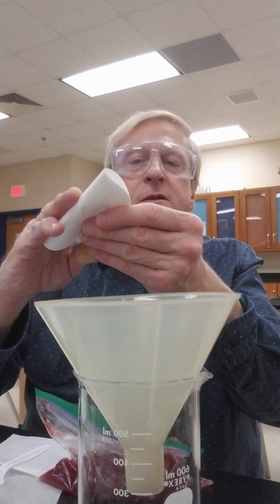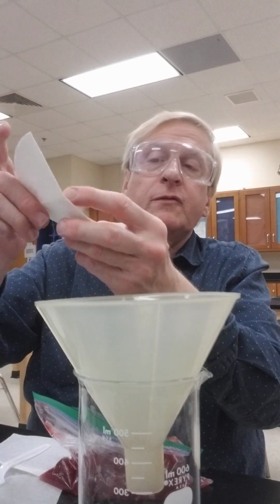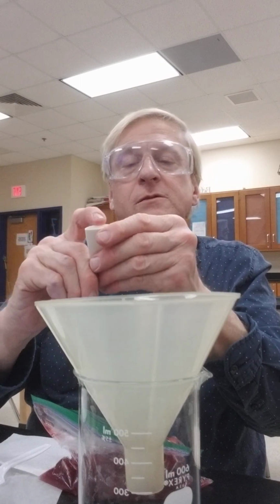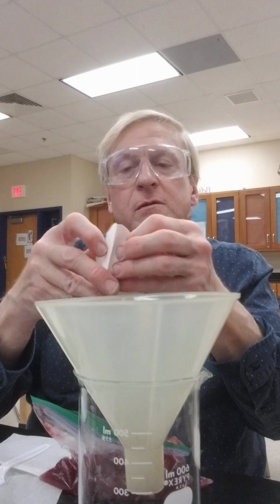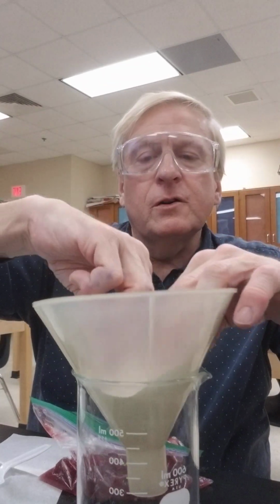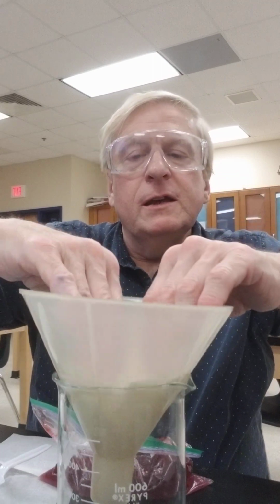So the best way to do this with these scientific filters, like a coffee filter, sometimes you don't need to do this. They come like that. I just fold it in half, then in quarters, then in eighths, so that when you unfold it, it's open. Again, you're just going to double one of these down like this so you get a little cone shape.